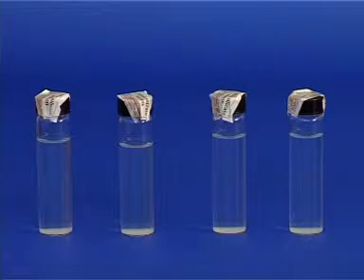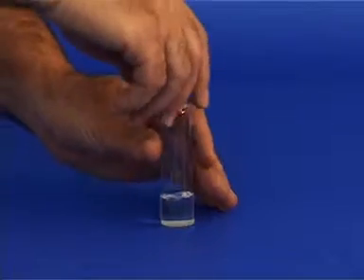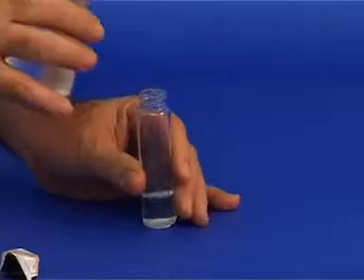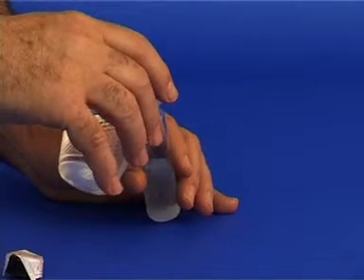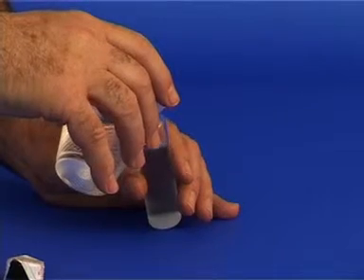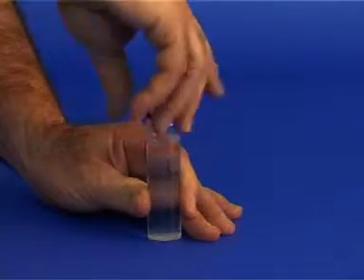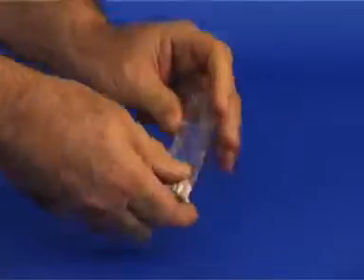You have four glass vials. Each one contains a small amount of concentrated solution. To each vial, add water warm to approximately 40 to 50 degrees centigrade. Fill each vial with the water, leaving one centimeter unfilled. Screw the lid back on and mix well by turning the vials upside down several times.